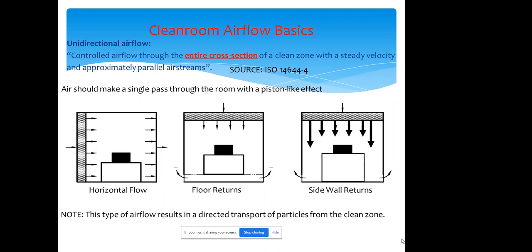The more you disturb the air movement, and if you know that you have a laminar flow air system, you should be able to say, wait a minute, if I dance around in here, that means the air is not flowing unidirectionally anymore. And what is the result? The result is going to be turbulence.